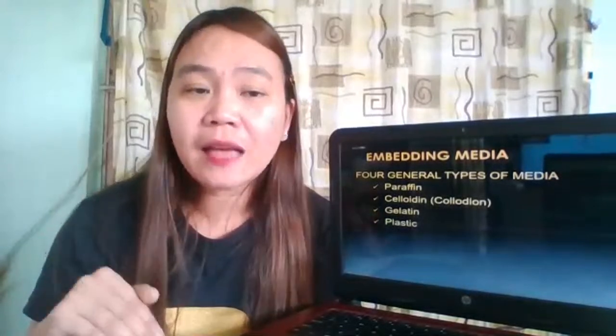So why does it have to be the same? It has to be the same because we want to achieve a similar or the same consistency of your tissue sample and your block. That means the hardness of your tissue sample should be the same as that of your block, so that later on, when we perform sectioning, it will be easier for us to have thin slices of your tissue sample.